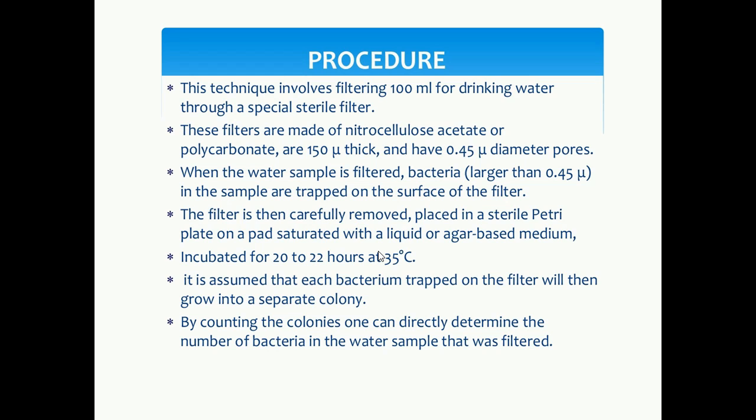Here we are observing this technique involves filtering 100 ml of drinking water through a special sterile filter. These filters are made up of nitrocellulose, acetate or polycarbonate, are 150 microns thick and have 0.45 micron diameter pores.